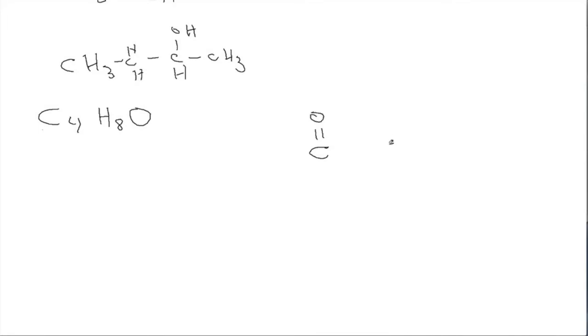So I just wanted to point out to you here, we know from the 1700 that there's a carbonyl, so we can write this down. We know that it's not an aldehyde because there's no 9 to 10 peak in the proton NMR. So we know this is a ketone, so there's a carbon on both sides. And actually, there's only one more carbon, right?